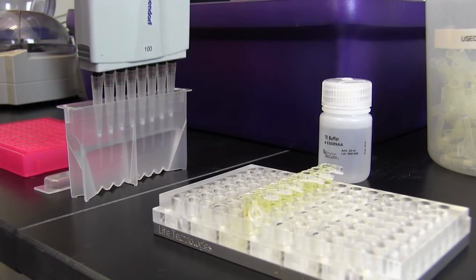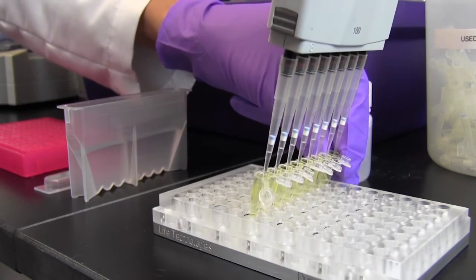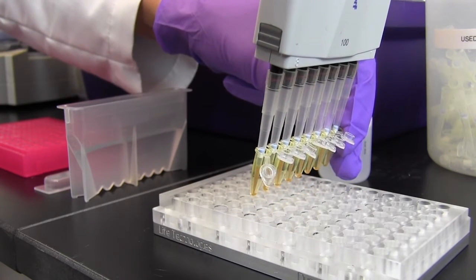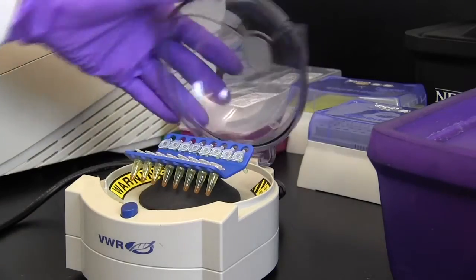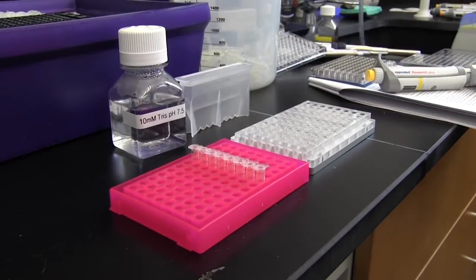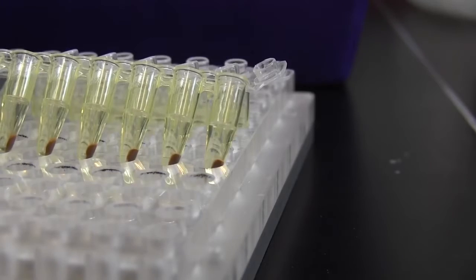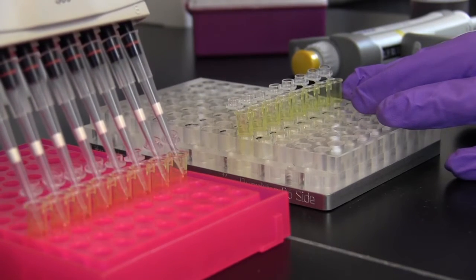Remove the tube or plate containing the dried bead pellet from the magnet and elute the library from the beads by adding 17 microliters of Tris-HCl or 0.1x TE buffer, followed by mixing well by pipetting up and down or vortexing. A quick spin may be required to collect the liquid to the bottom. Incubate for an additional two minutes at room temperature. Return the sample to the magnet for five minutes or until the sample clears, then remove 15 microliters of the supernatant and add it to a fresh PCR tube for library amplification.